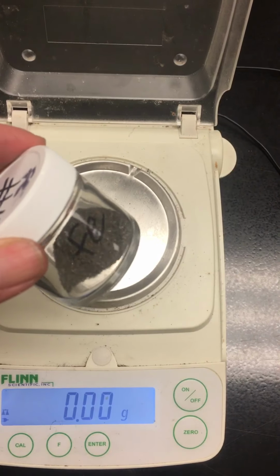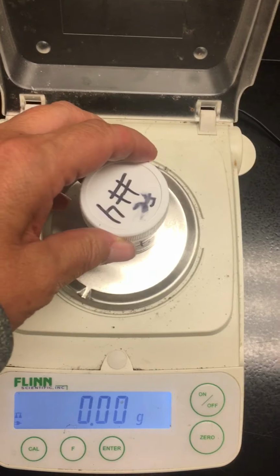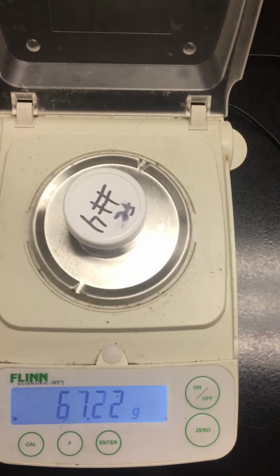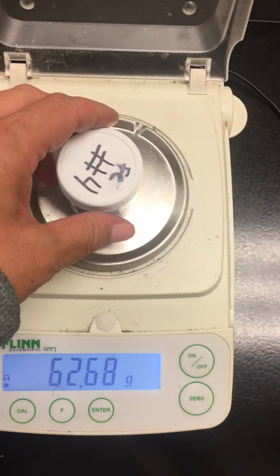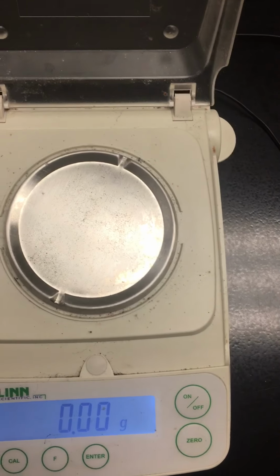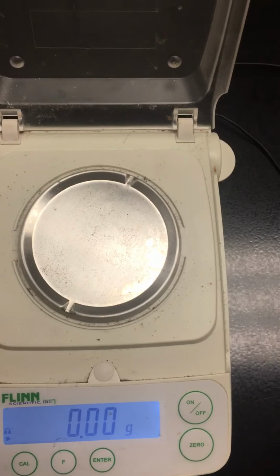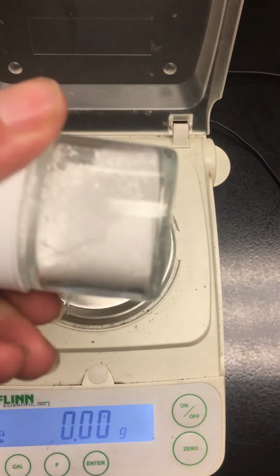Mass of number 4, Fe, and these are just little filings. You're to write down what that is, the actual name of the element. One, 2, 3, 4. Mass of number 5. A white powder.